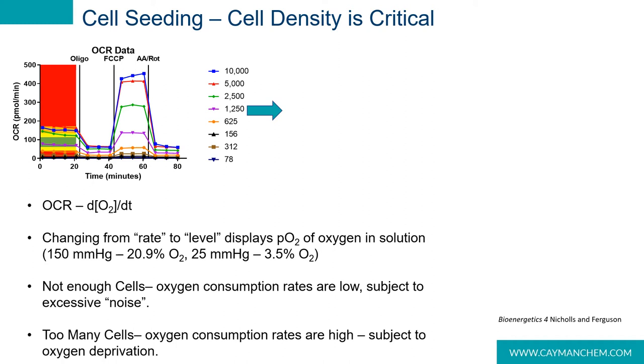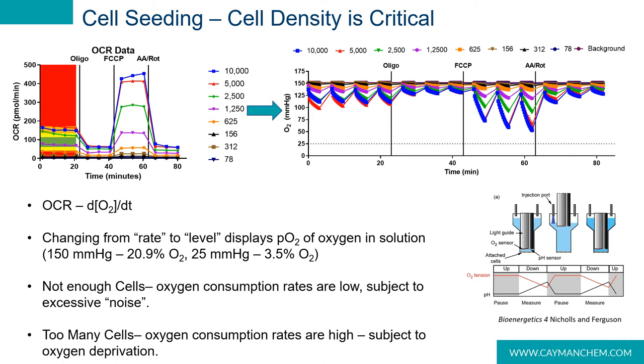To illustrate this, I'm showing data from a cell seeding titration in C2C12 myoblasts. These cells were seeded at the densities indicated and cultured for 48 hours, then a mitochondrial stress test was performed. Our basal oxygen consumption values are all below 200 picomoles per minute, and our maximal rates are just over 400 picomoles per minute. In the XF software, if you switch the view from rate to level, you end up with a screen showing the partial pressure of oxygen in millimeters of mercury rather than OCR. If the cells are seeded too low, the oxygen consumption rates are low and subject to noise. If the cell density is too high, oxygen deprivation can be a concern when FCCP is added. The dashed line on the graph indicates the partial pressure where oxygen limitation can start to be a concern.